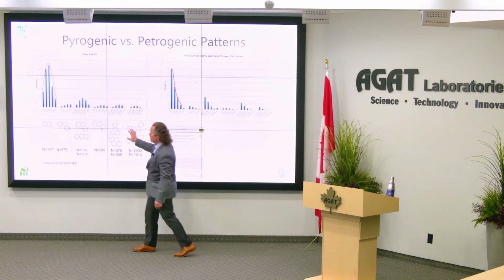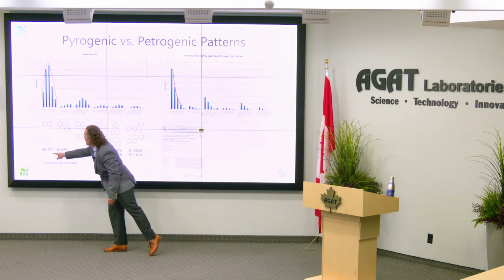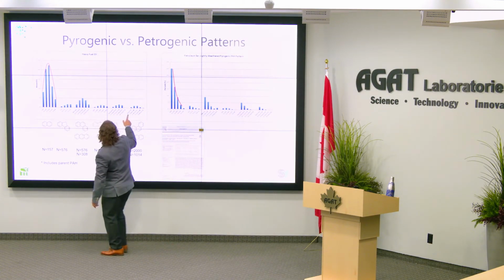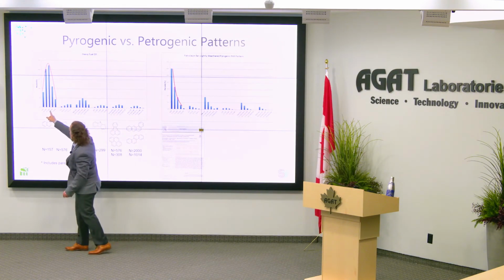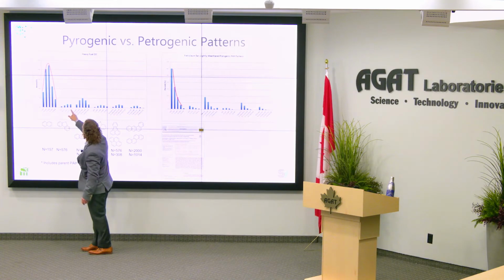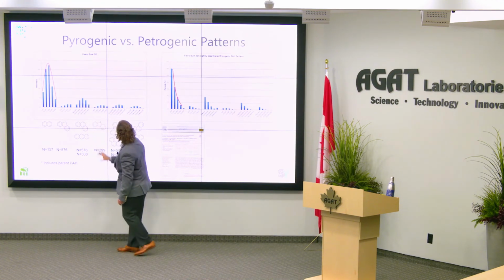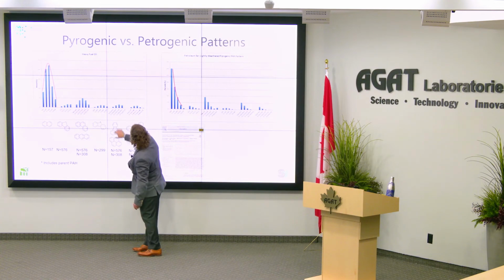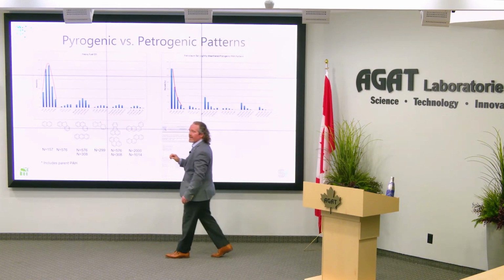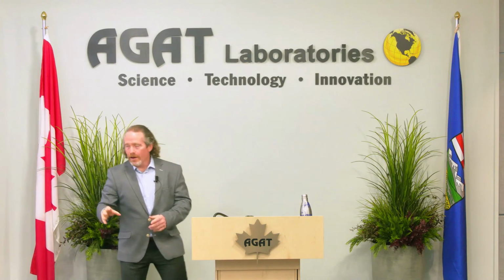And just to reiterate this point about the number of PAHs, this is the number of PAHs that is in each of these groups. So there's 157 things being represented by this cluster. There's 576 things in this, and 308 in that one, 299 in that one. So that just gives you an idea of the amount of compounds that you're measuring as part of your alkylated PAHs.